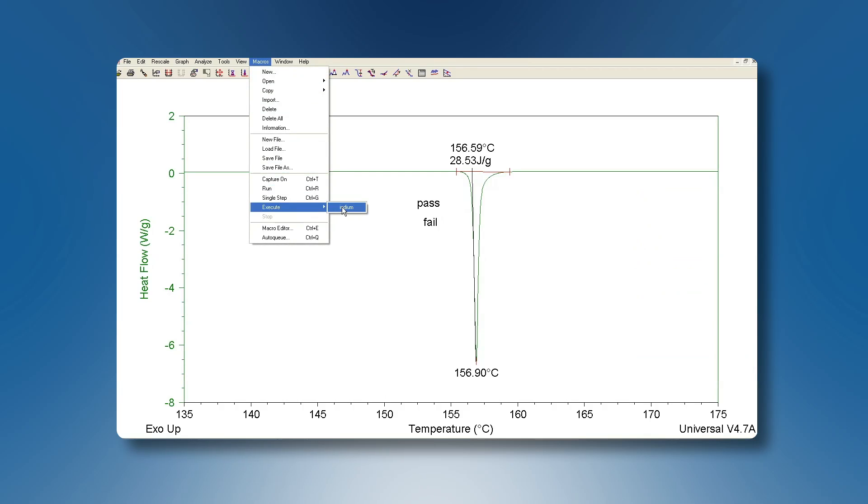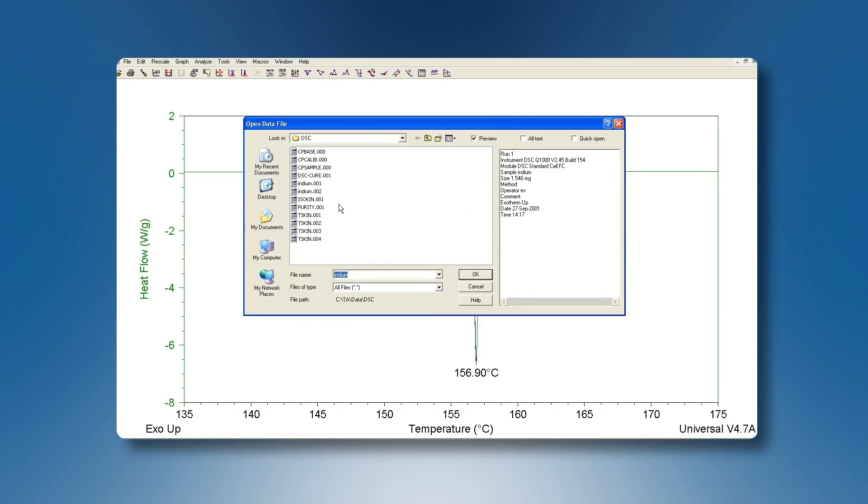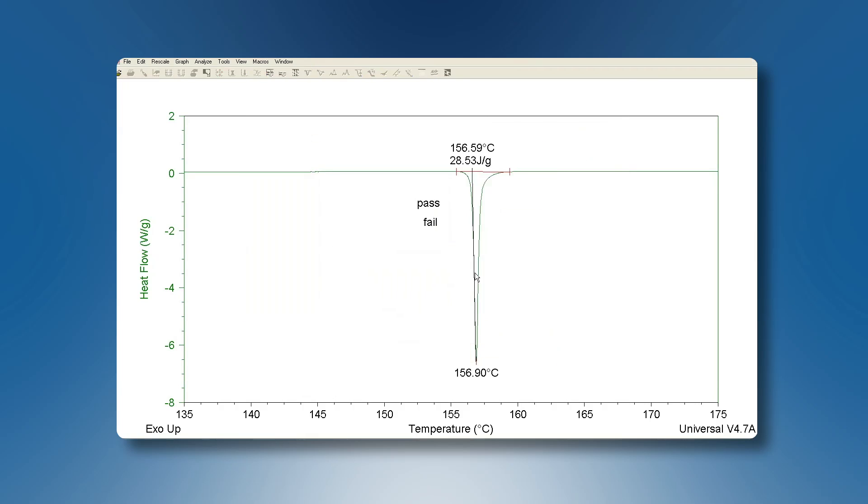Now let's try it out by executing it. First of all on an indium sample where we expect the enthalpy to be ok. So as you can see the enthalpy is ok and we get a pass message.